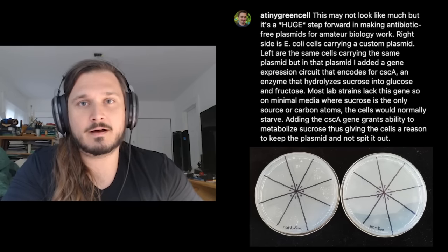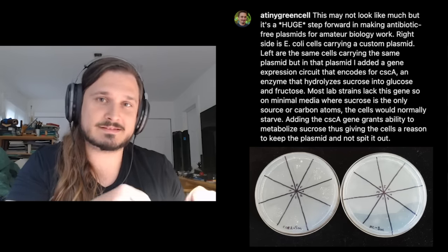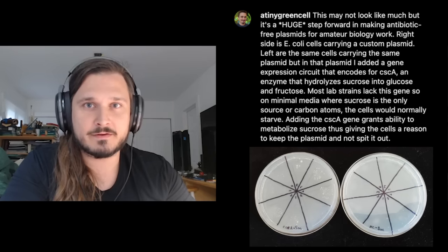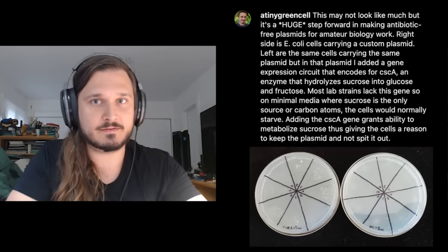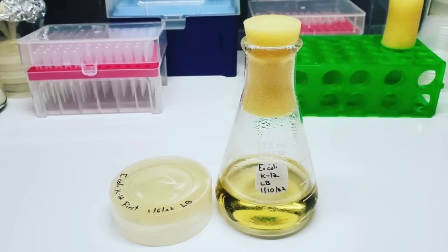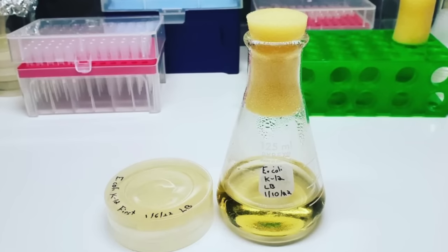And along that way, I started listing what were the most limiting factors of this process. And the two major things were antibiotics and herbicides, right? In antibiotics, especially for molecular cloning, you need them in order to construct plasmids and then select. Plasmids are little circles of DNA, kind of like scripts, that you put in bacteria. And a special kind of bacteria, Agrobacterium tumefaciens, transfers that DNA into the plant, right? So you construct your genetic circuits in E. coli, and you do so by selecting for the cells that carry your plasmid using antibiotics. When you move the plasmid from E. coli into Agrobacterium, you also have to select away the Agrobacterium that doesn't have your plasmid, and you do so as well with antibiotics.